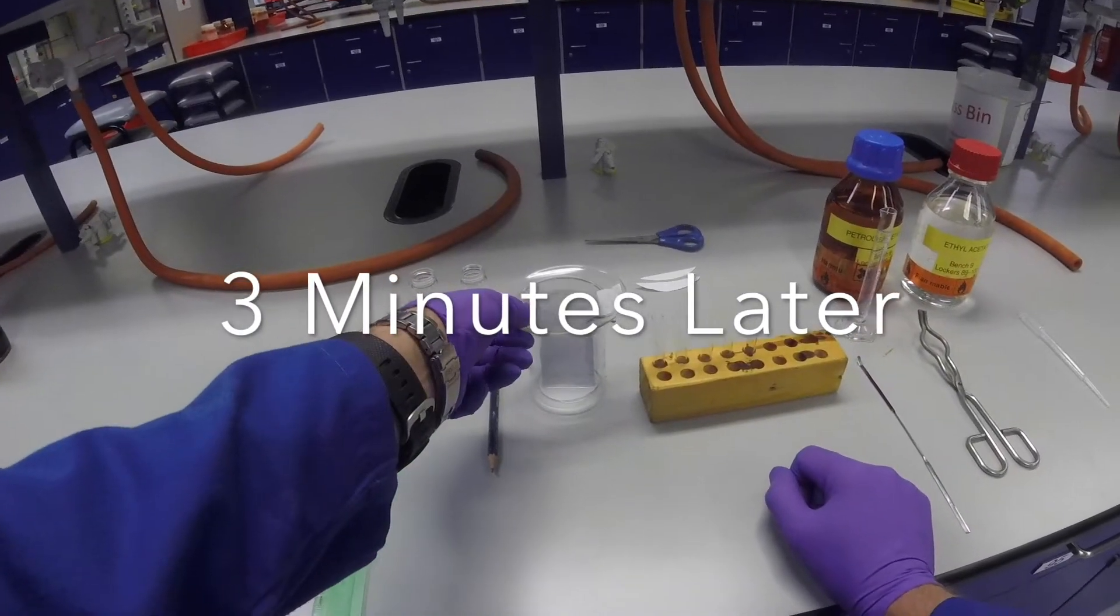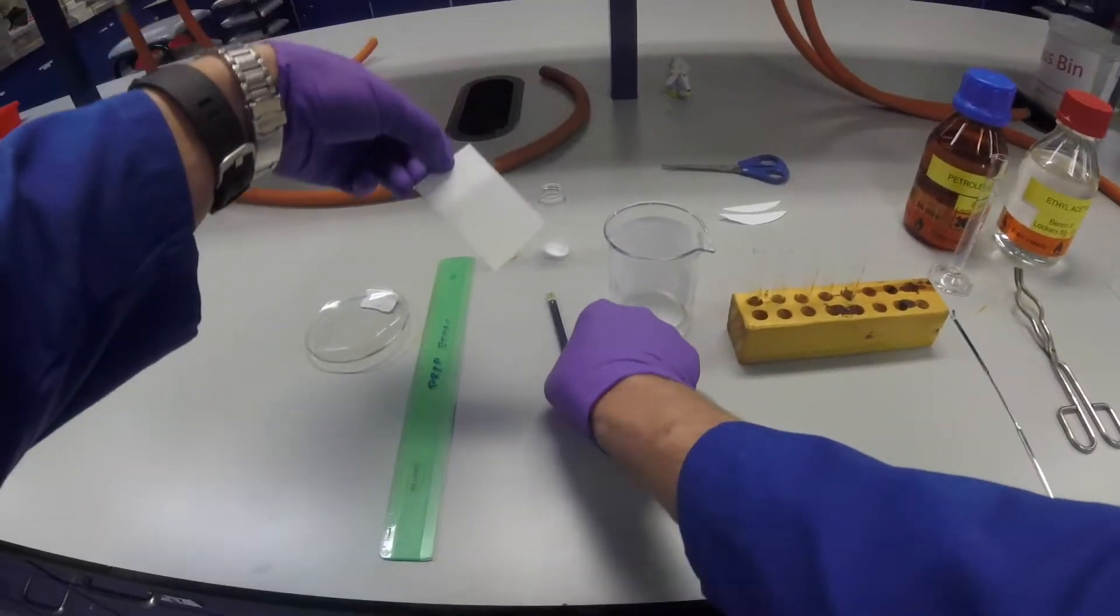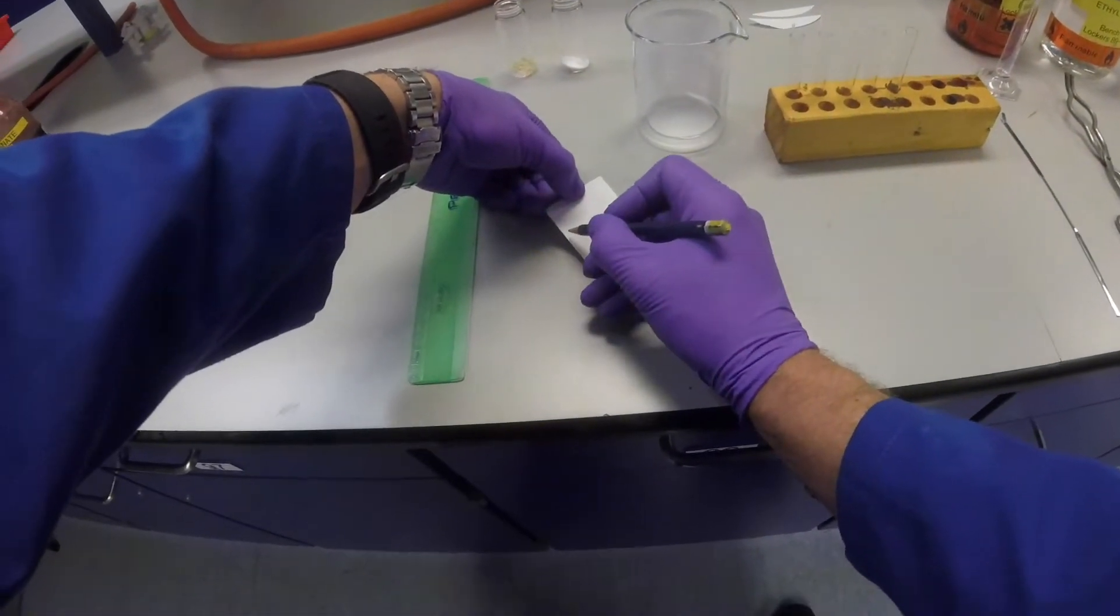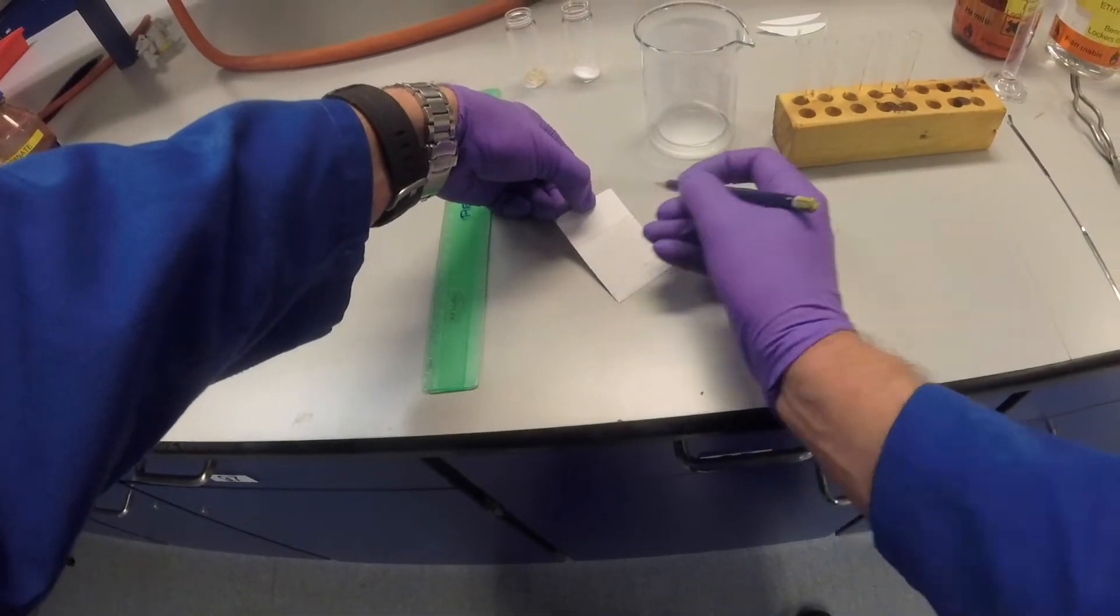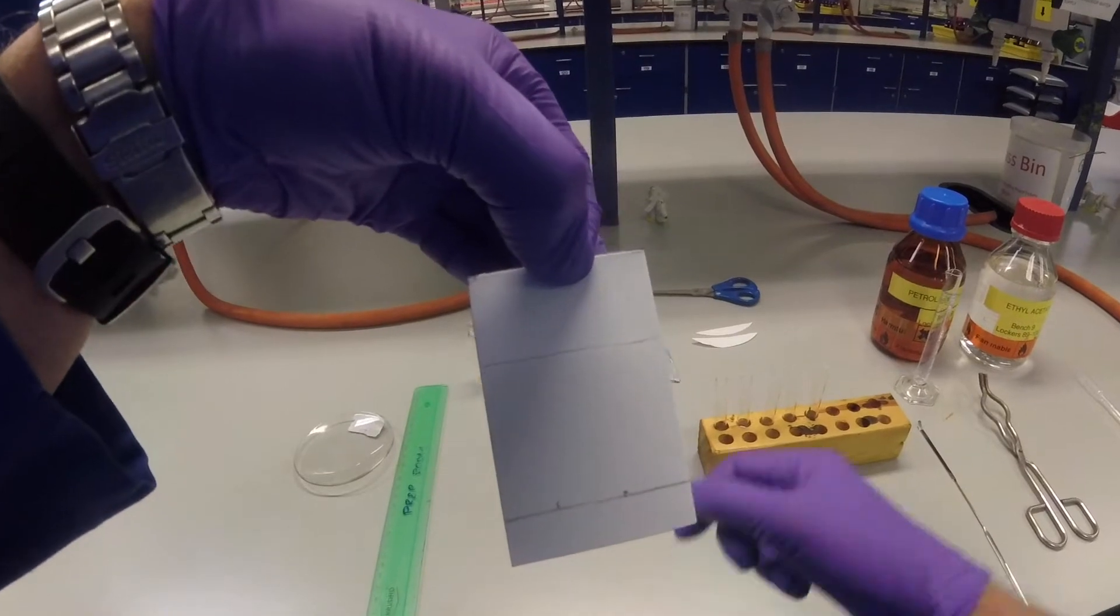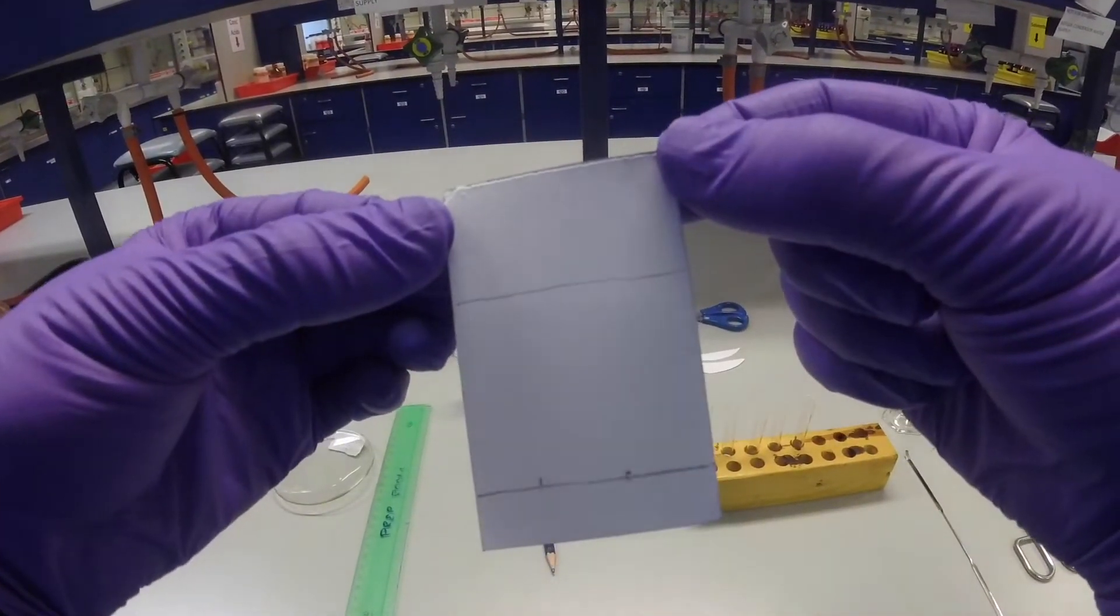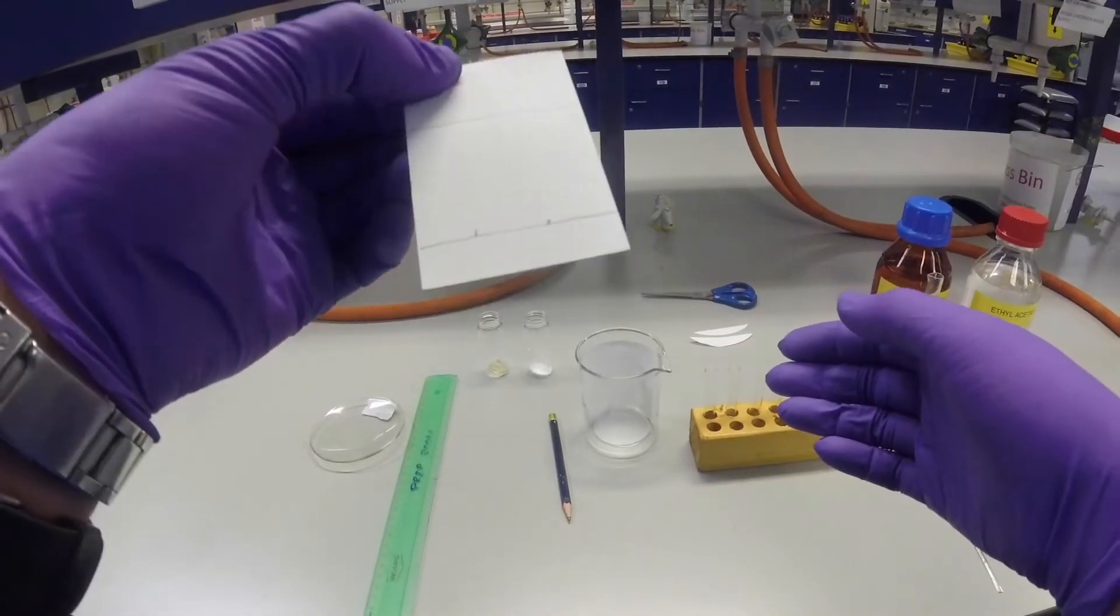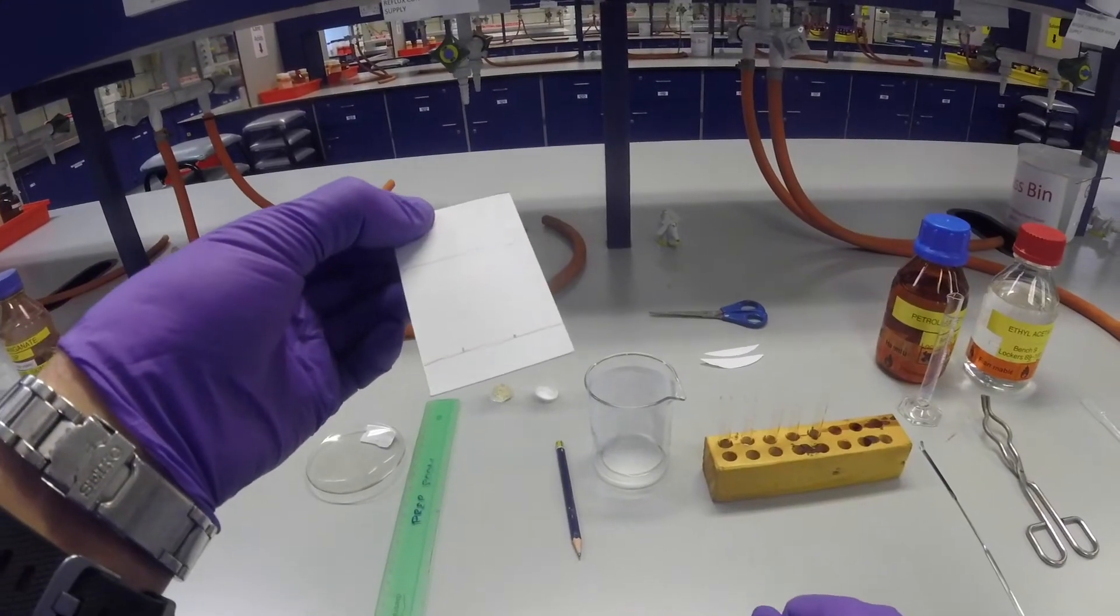I'm going to stop the TLC now. Take the top off, reach in, take it out, and very quickly draw a line where the solvent got to. That's a pencil line marking off the limit for where the solvent reached on that plate. We're going to allow it to dry now to make sure all the solvent's evaporated.